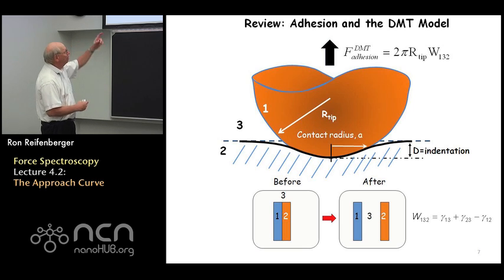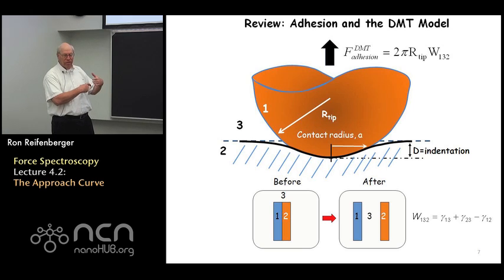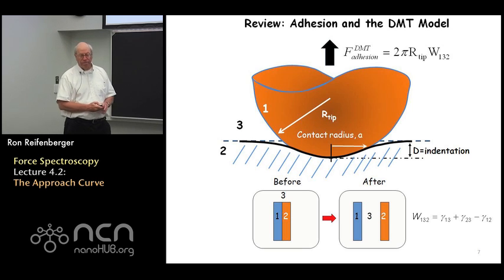So the naming conventions for W132 that we discussed in week 2 of the class, I just bring back here to remind you what in principle you could measure if you can convince yourself that the van der Waals force is dominant in this adhesion of the tip to the substrate. So a lot of effort is expended into making this approximation valid, right? So you have to have good control of your tip, good control of your substrate, and if you do that, then you can start to measure something that's quite interesting.